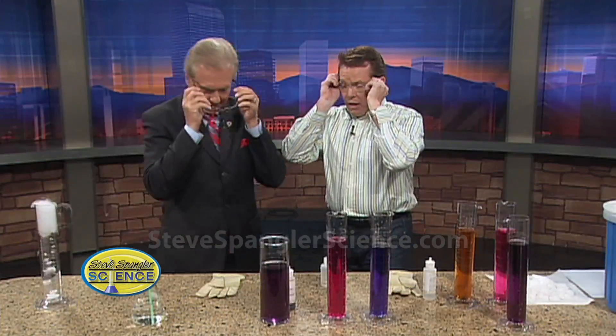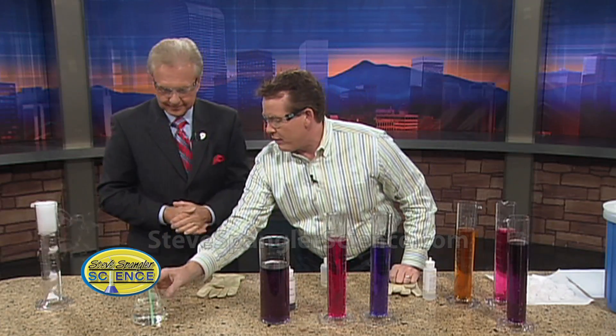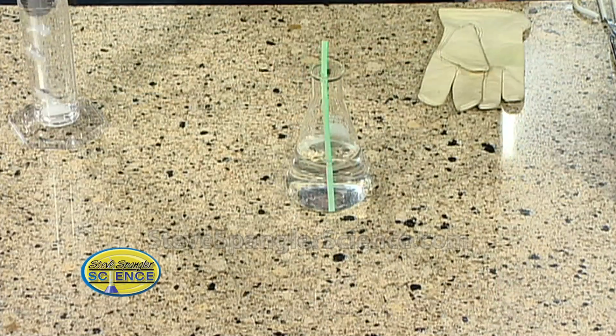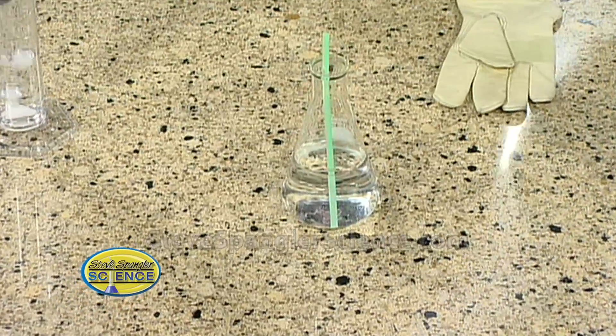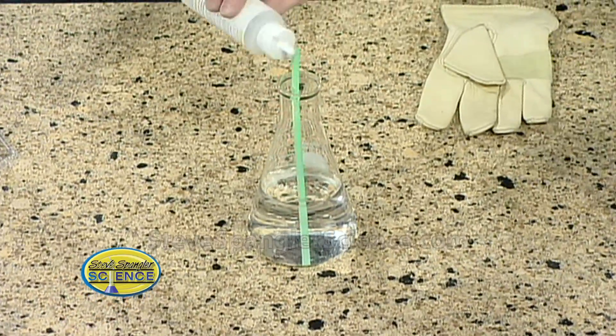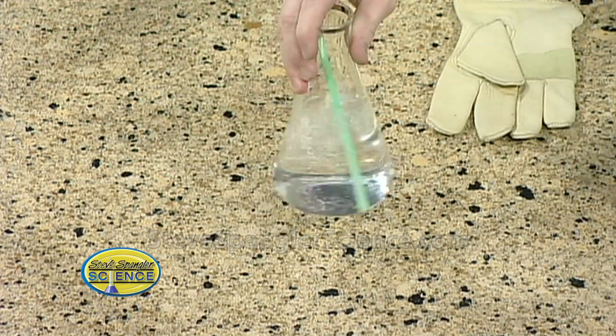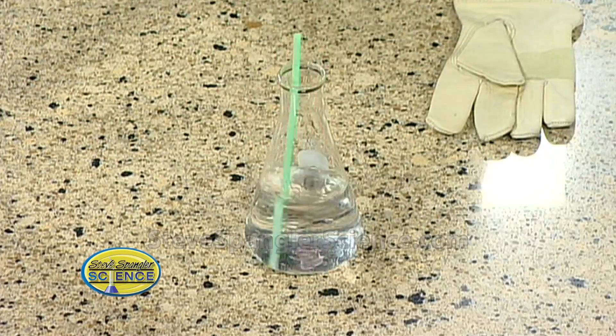Put on your glasses. Let me show you what this looks like. First of all, I have just a flask and I have some water inside, and I'm going to show you what the potion is that we're going to make. I'm going to put a couple drops of an indicator. This used to be Ex-Lax — it was ground up Ex-Lax — but they don't make it the same way anymore. It's an indicator called phenolphthalein. Notice how it's colorless in normal conditions.